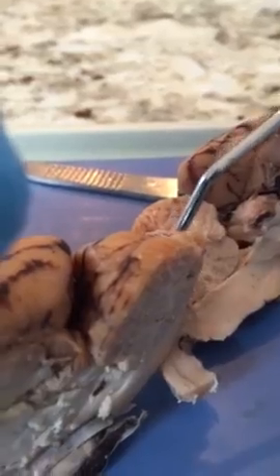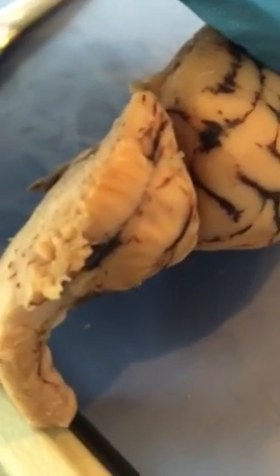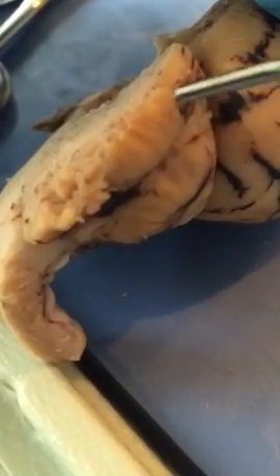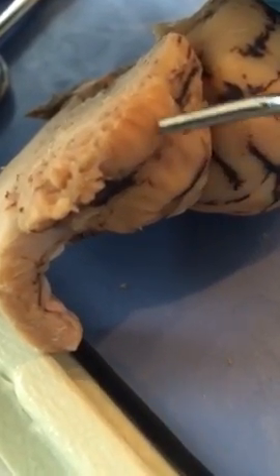The lateral hemispheres, you can see the lateral hemispheres if I can just somehow position this. Running laterally across here.